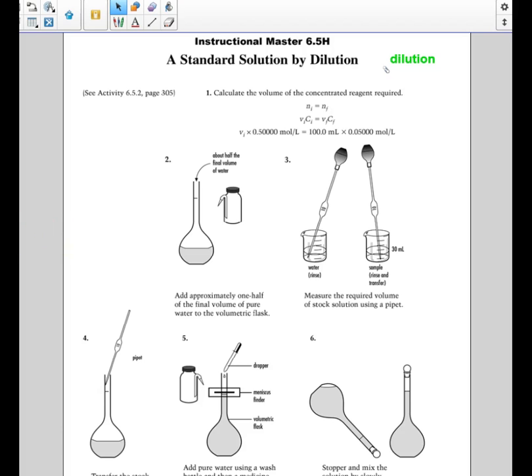Okay, so how did that compare to the steps outlined here? Well, again, the calculation was in the background. We saw at the very end there was a concentration listed, which I cut off, but the amount of the solution was decided at 500 milliliters, and then you'll notice that immediately the video cut to transferring from the pipette, so there was no rinsing the initial flask.